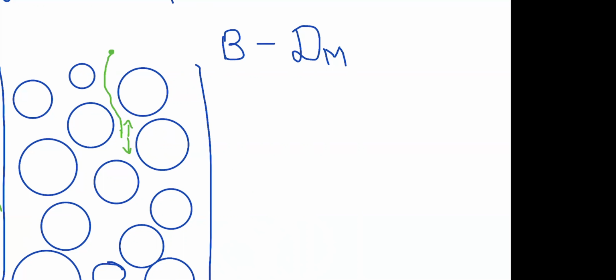So from this point of view, it would seem a very good idea to use mobile phases which are very viscous, so that the diffusion in the longitudinal direction would not impact our peak width. However, in reality, this is balanced out by the other diffusions that play a role in chromatographic systems, as well as the pressures that are required to push the very viscous mobile phase through the column.